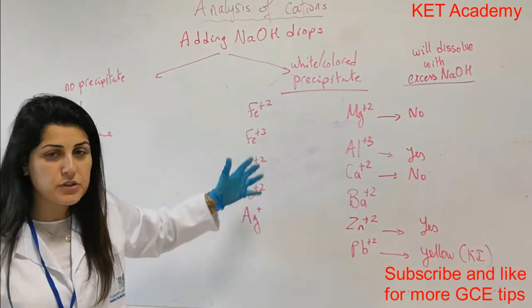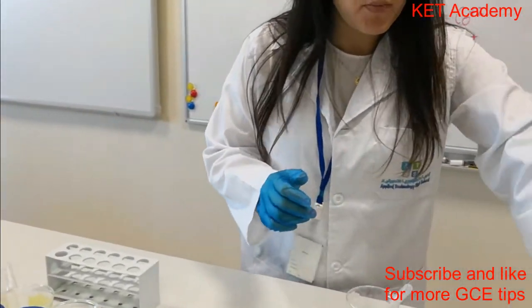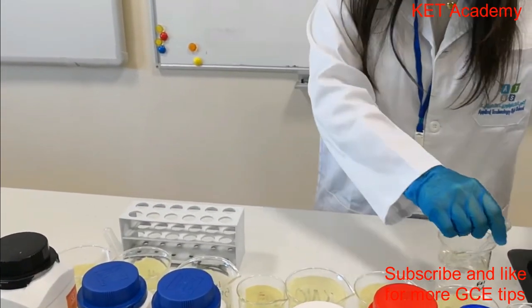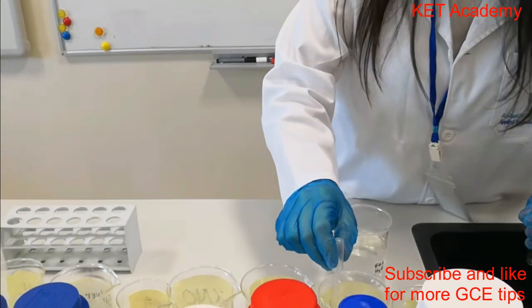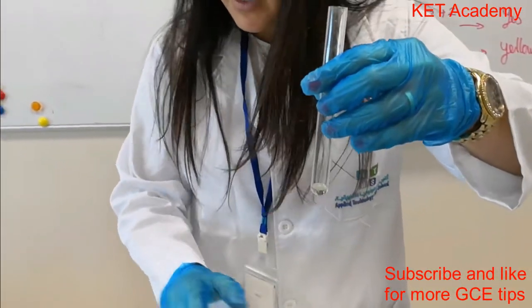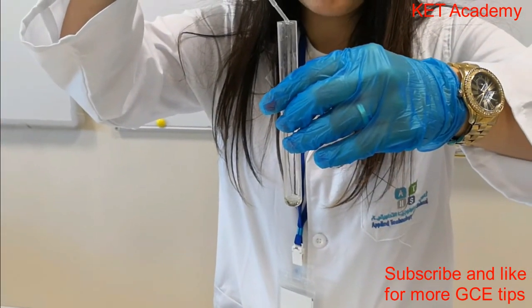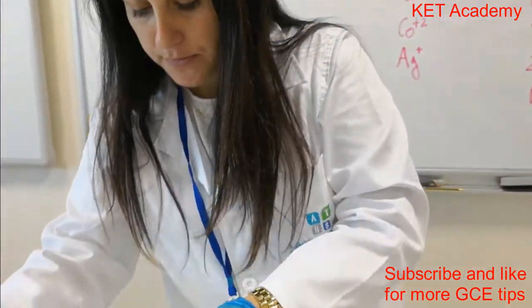So what we're going to do right now, I'm going to take a sample from a different cation every time, and I will add to it sodium hydroxide. So first, let us begin with lithium cation. Here, this is lithium cation. Adding to it drops of sodium hydroxide, nothing will happen.